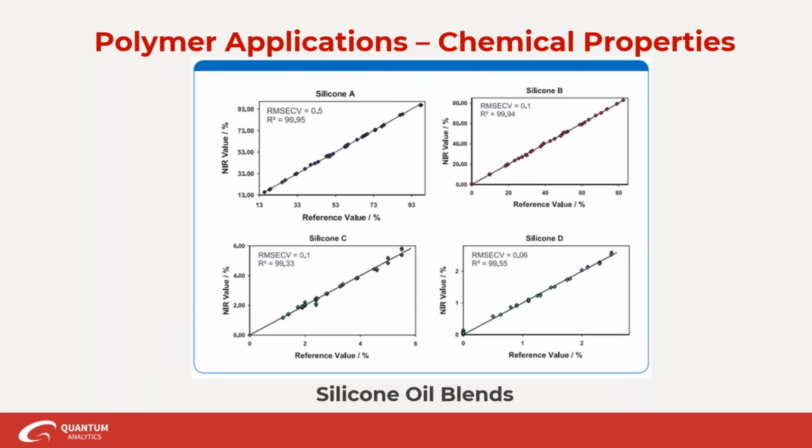So here's one that's a little bit different. This is silicone oil. Silicone oil is any liquid polymerized siloxane with organic side chains. The polymer backbone consists of alternating silicon and oxygen atoms. There's very high commercial interest in this stuff because it has high thermal stability and lubricating properties. And this is used in numerous industries as lubricants, thermic fluid oils, hydraulic fluids, including electrical, plastics, rubber, paper, textile, paint, automotive, construction, you name it.